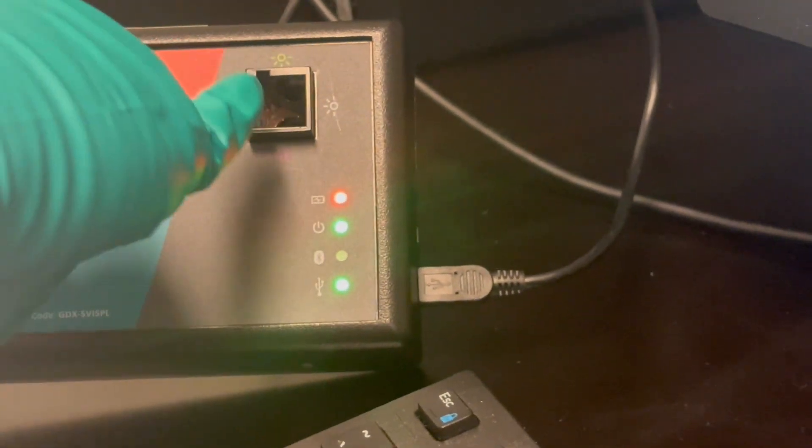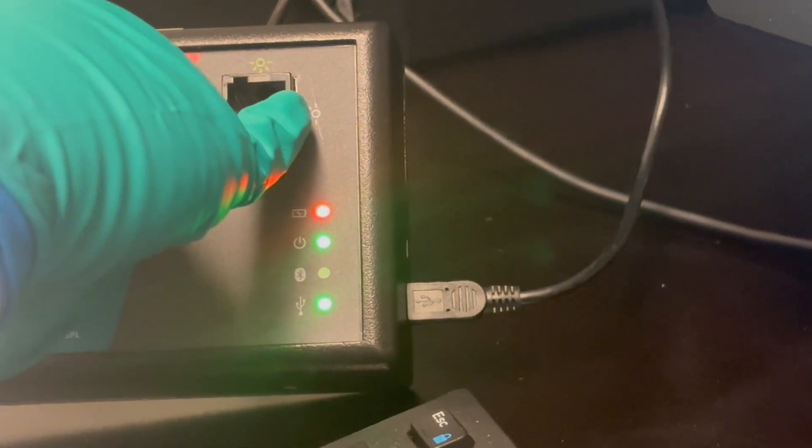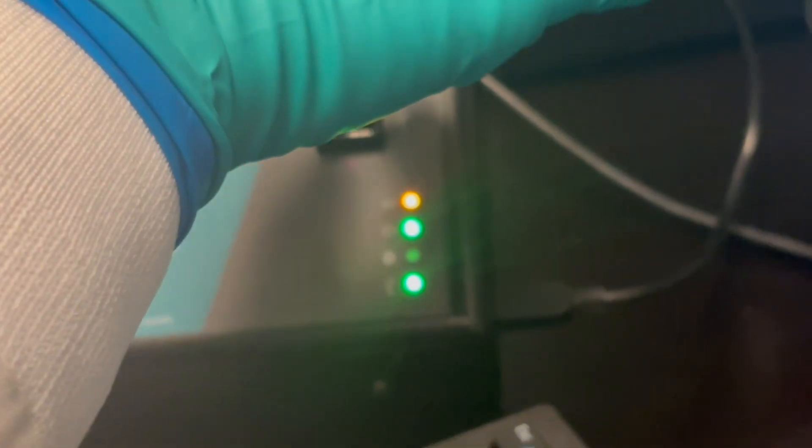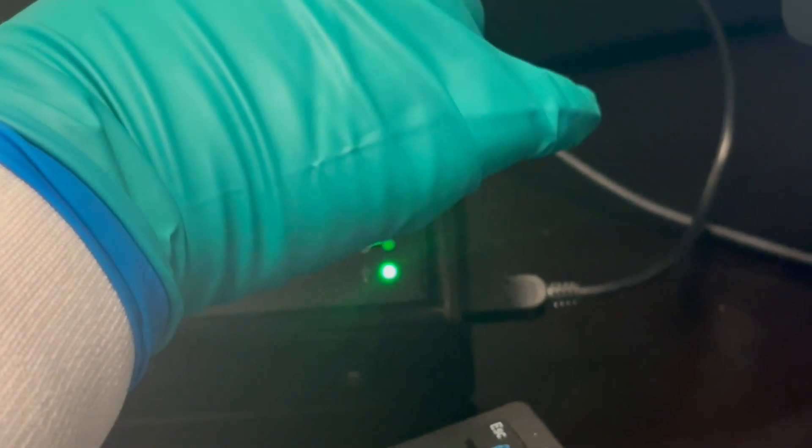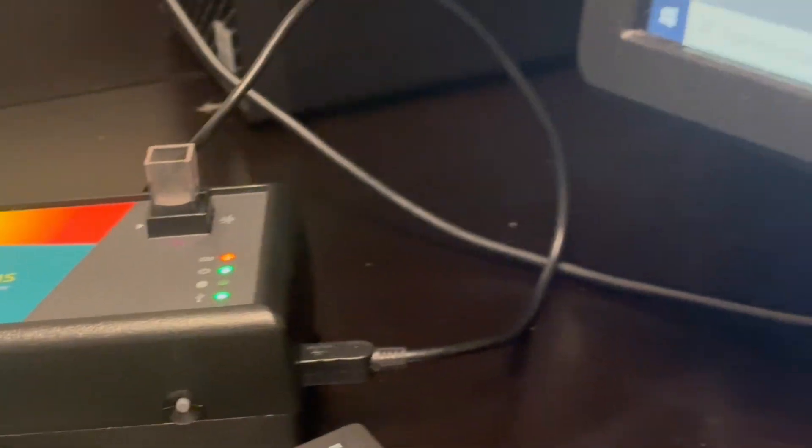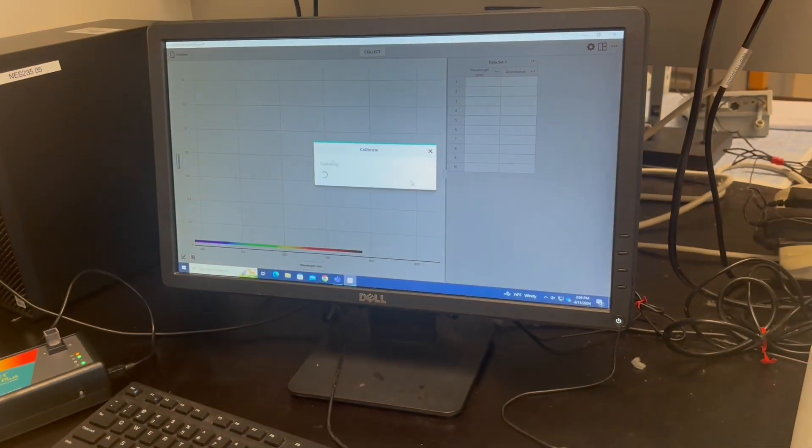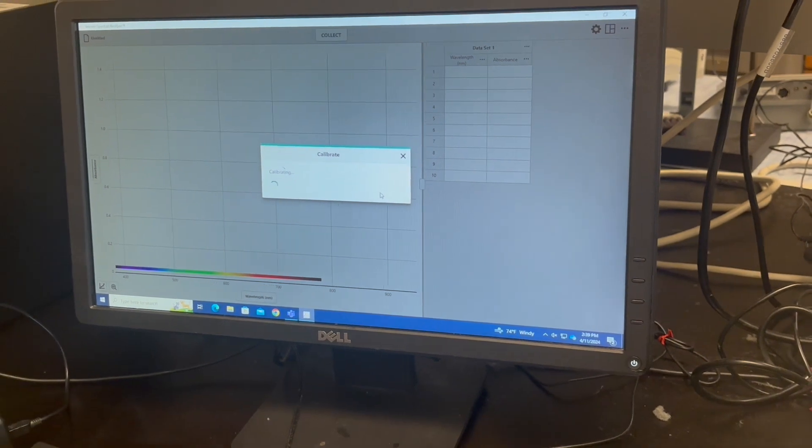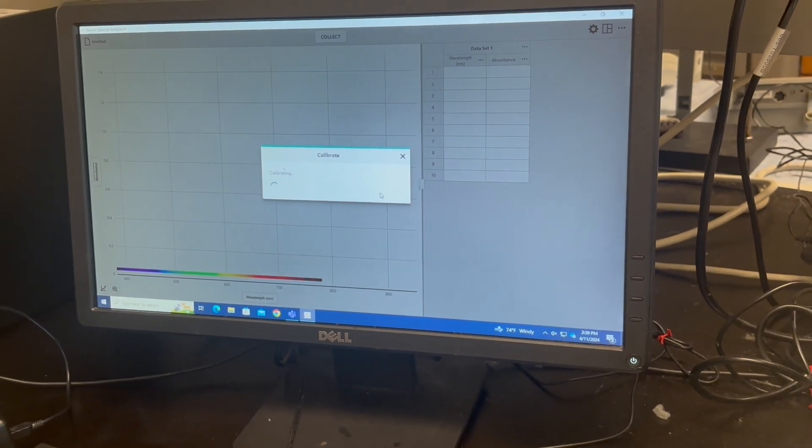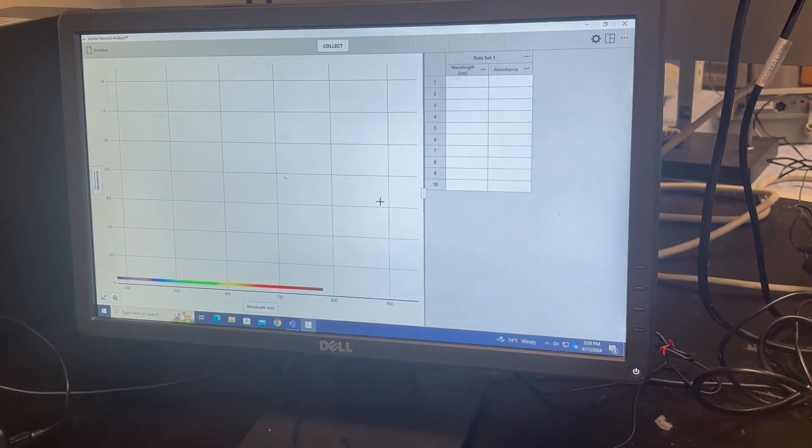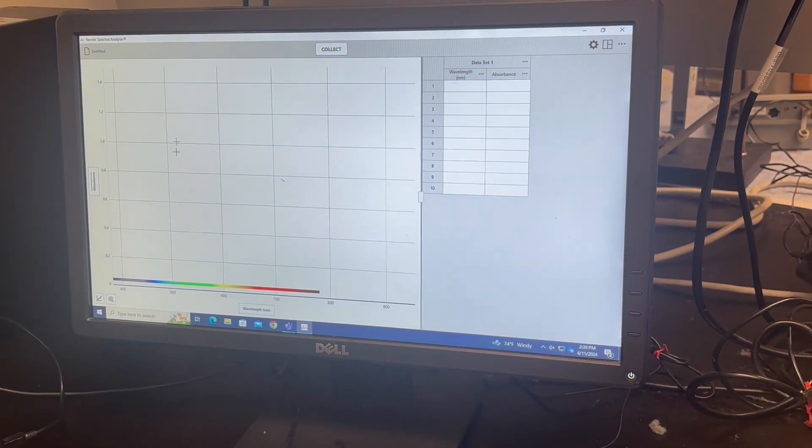You can kind of see the light source coming from this side and finishing over here. And you load that in. And then you go and click finish calibration.